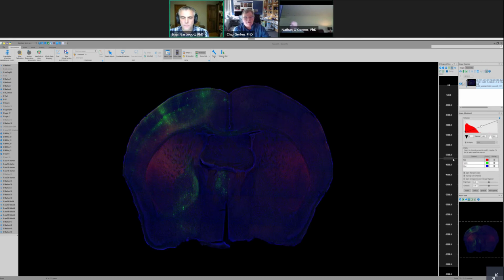As we're developing the pipeline for these neural networks, initially we started with what we've got, and then we're making sure that those networks work with tissue from other labs. That's an important thing. As we get tissue from other labs, and I'm sure MBF welcomes donations of images from other labs, you can provide that, and then we can run that on the network. Eventually this could be developed so that we could get training data from users, to broaden it, because the more types of neurons we have from different types of tissue, the networks are going to get better and better.